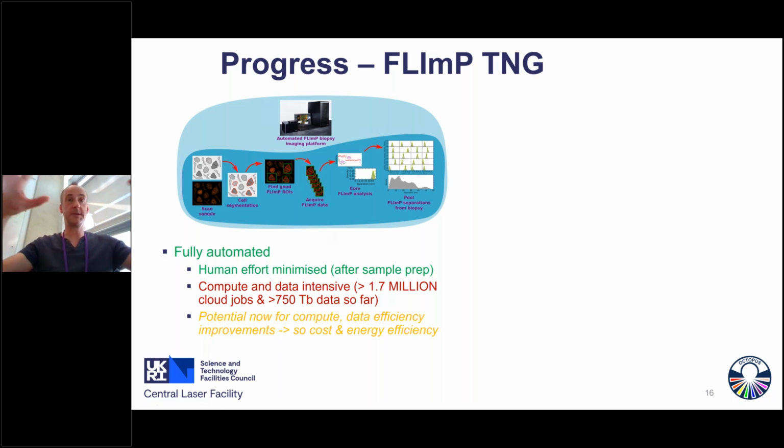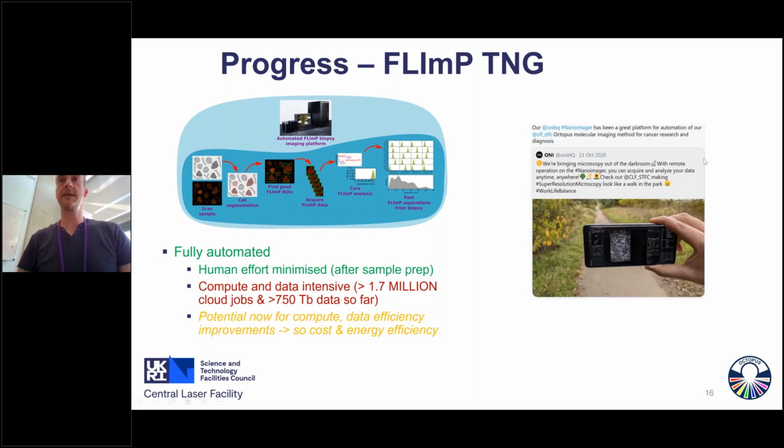But the bit we were able to do, the automation of the acquisition and analysis, essentially we think we were very successful with that. And then this just demonstrates what the automation and remote access enable us to do.